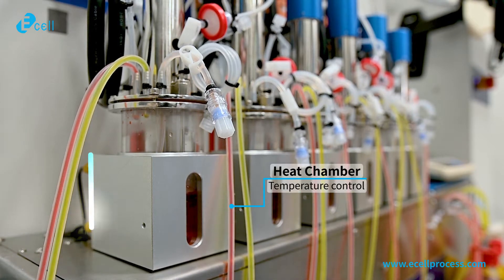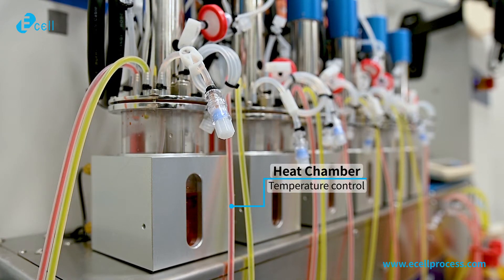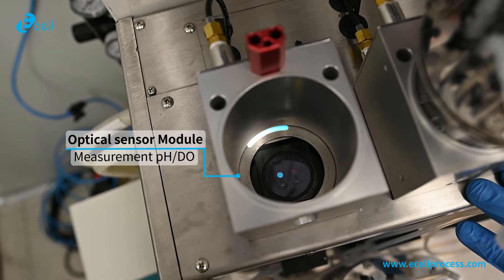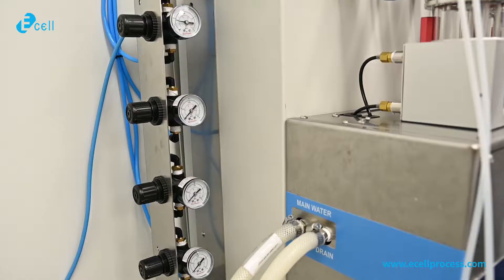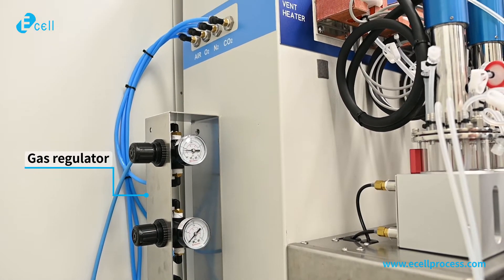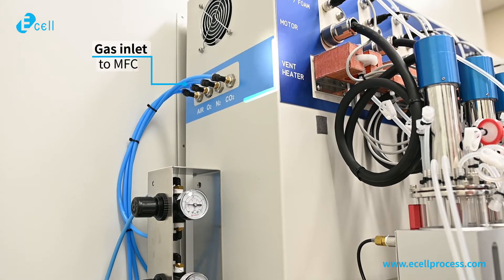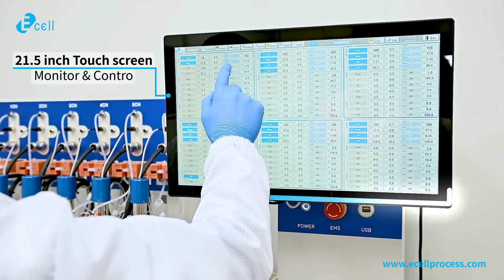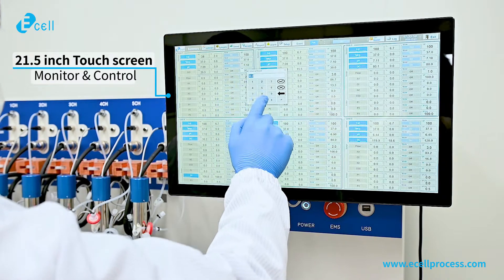Heat chamber for vessel temperature control. Optical sensor measurement module for measuring the current value of pH and DO. Gas regulator for individual gas supply to MFC. 21.5-inch touchscreen monitor to monitor and control all parameters.